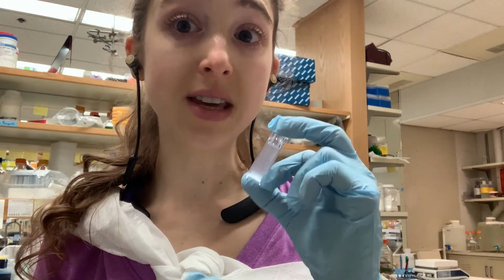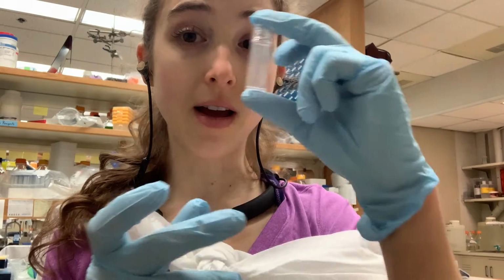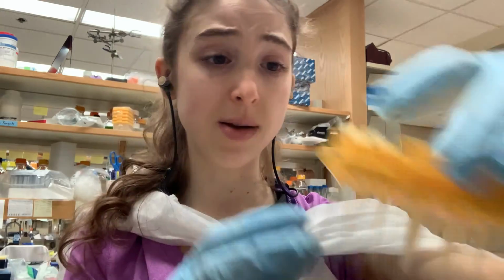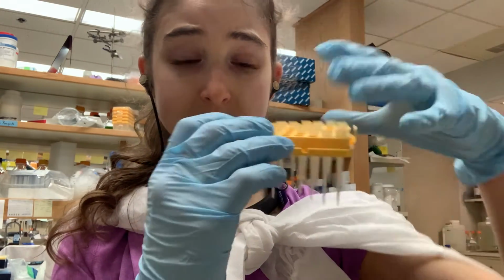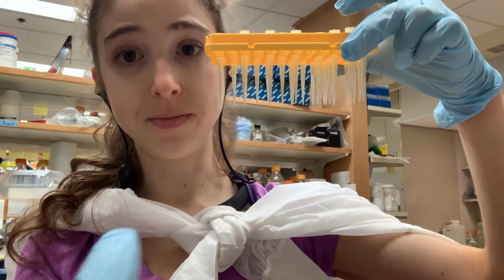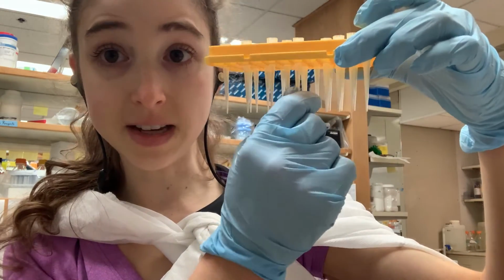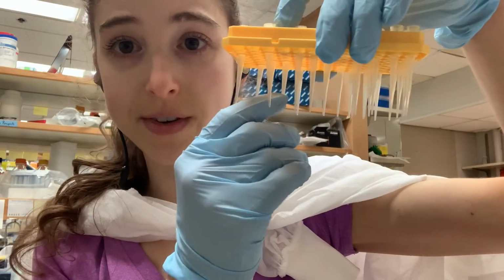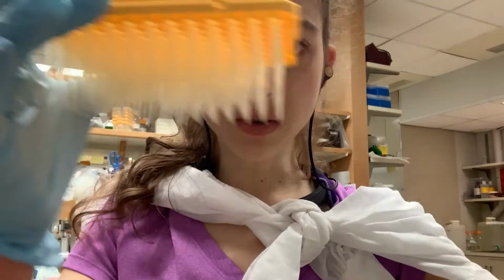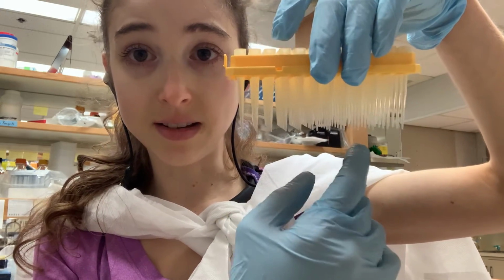We'll also have the concentration. So the concentration is going to affect this, because the more of the stealers you have, the more light can be stolen. I don't have good props, but if you take this pipette tip, you can think that if I shine light through here, it will encounter some of these and absorb. And the higher the extinction coefficient, the more each of these will absorb. Now imagine I have a full tip rack. Now it's going to encounter more of these, so it'll get absorbed more.